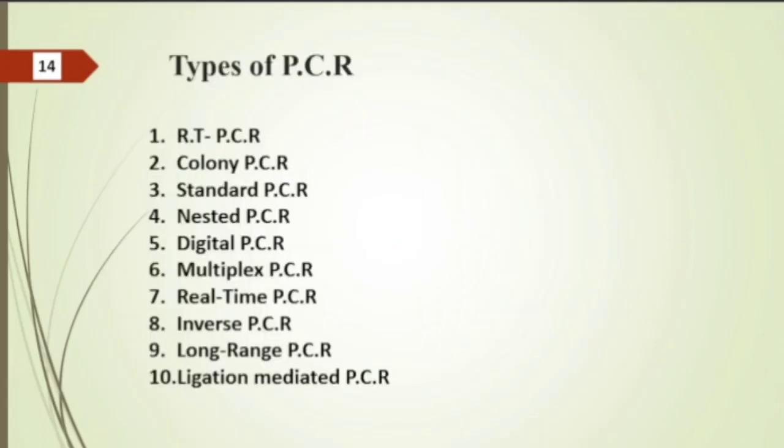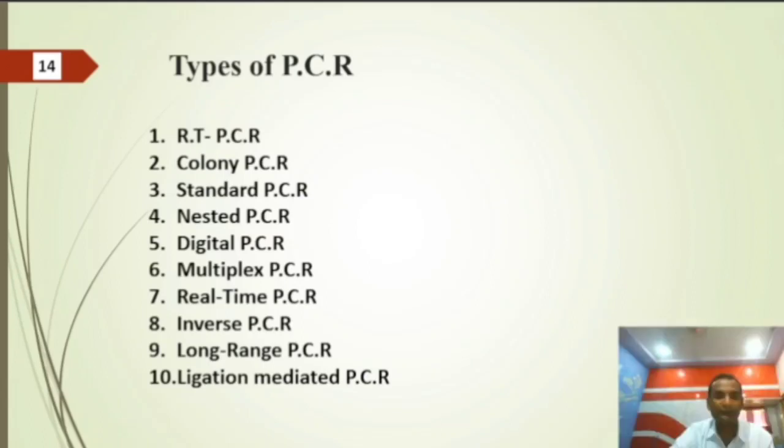There are different types of PCR machines. There are different types of PCR techniques we can observe. There are more than 20 to 25 types of PCR techniques for different purposes.